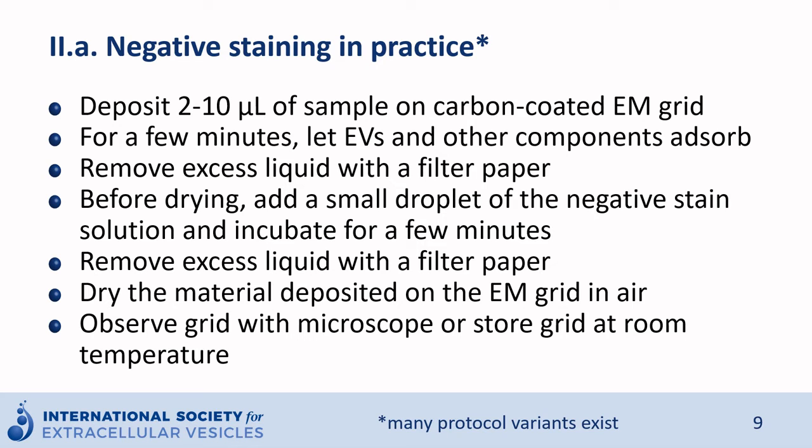Remove the excess liquid with a filter paper, dry the material deposited on the EM grid in air, and then the grid is introduced and observed in the microscope, or it is stored at room temperature and observed later. This is one negative stain protocol. There are many variants.